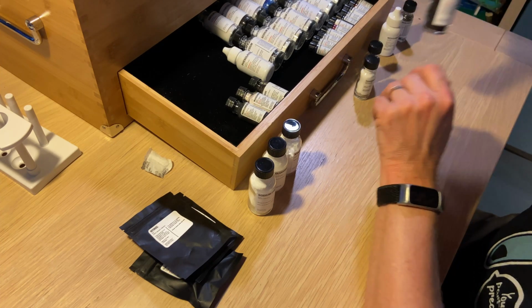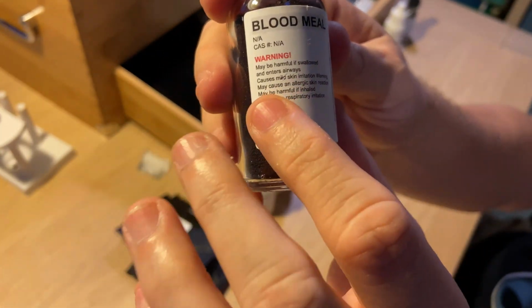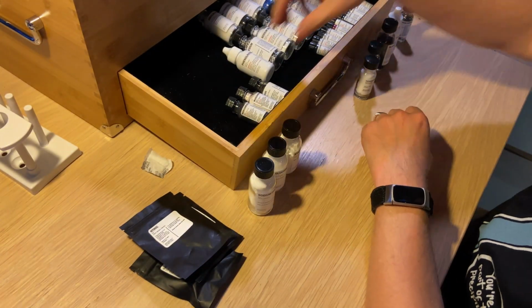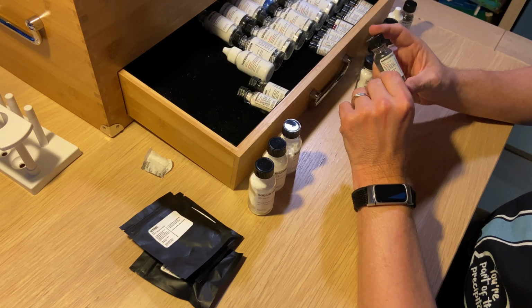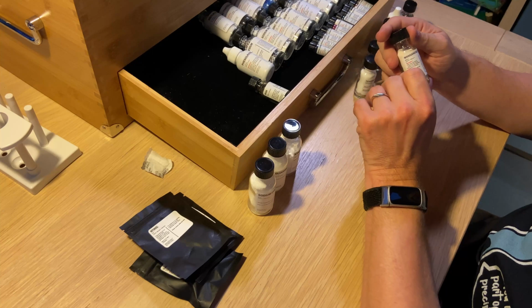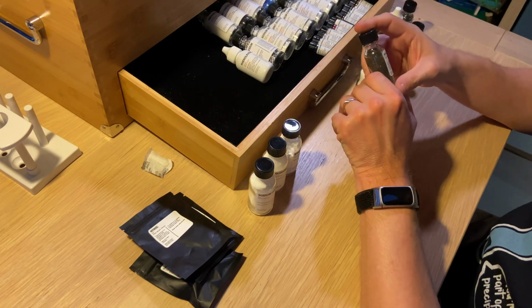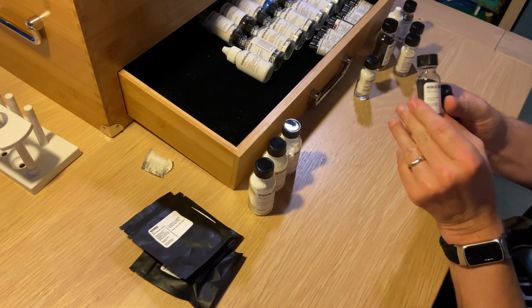And the cool thing, and this is what I want to show a little bit, is that on the flask you can see all the cautions that you have to take, and it's also showing the symbols of how dangerous the substances are. I think that's a really important and good detail that it's on there. Manganese dioxide. Manganese 2 sulfate. Now manganese is a very interesting element that I hope I will get at some point as well. Iron. Now, interesting. So we have iron oxide and we have iron.